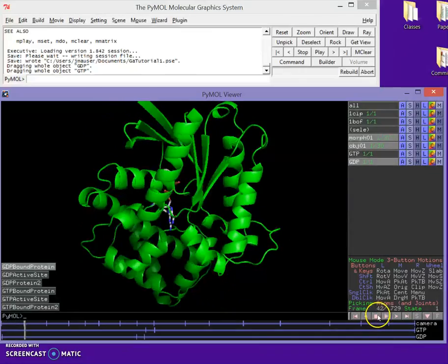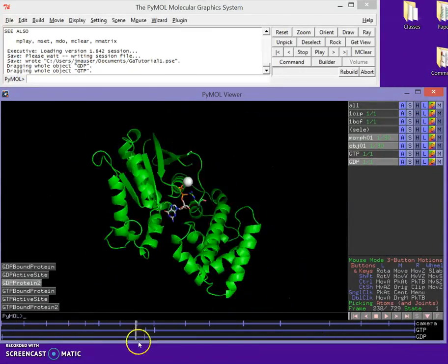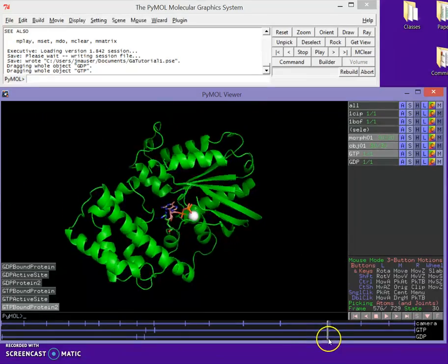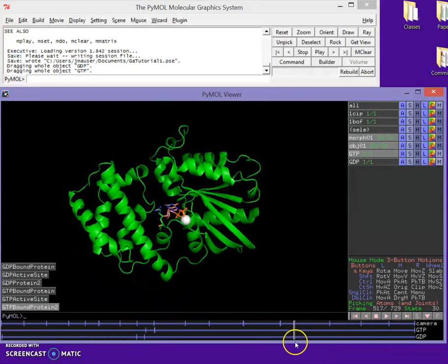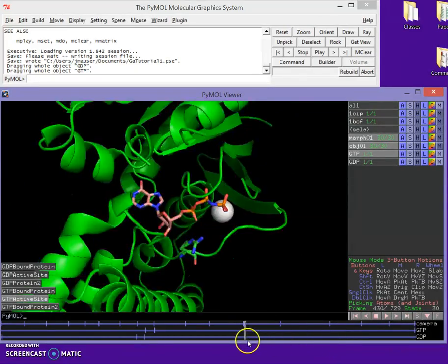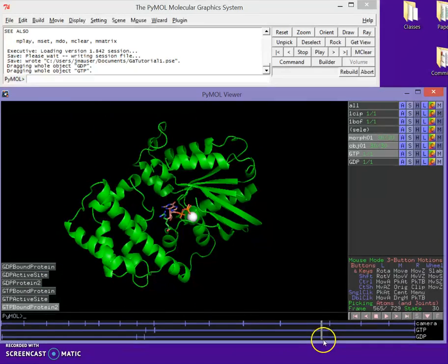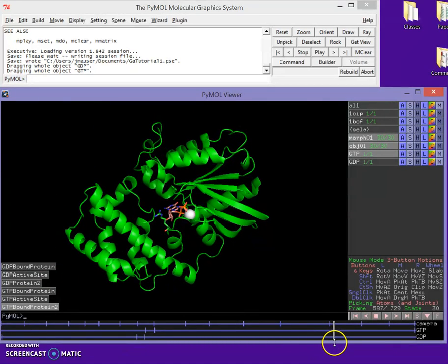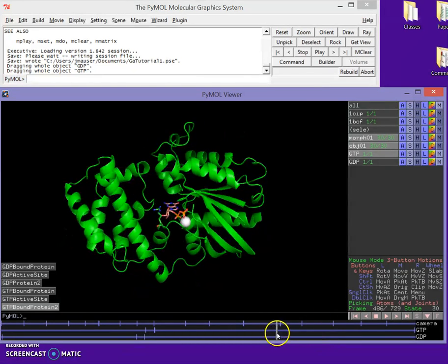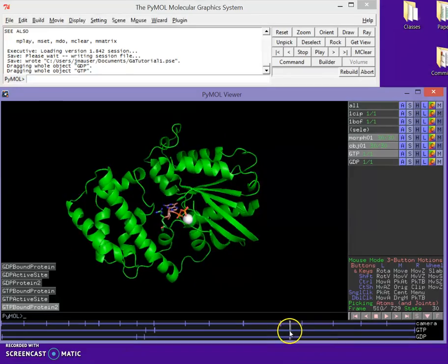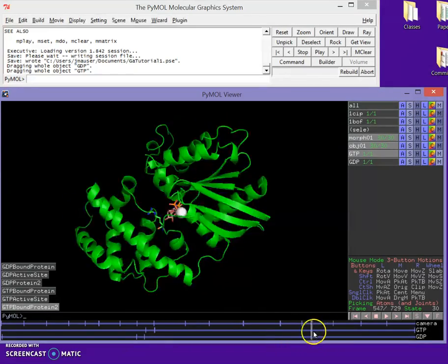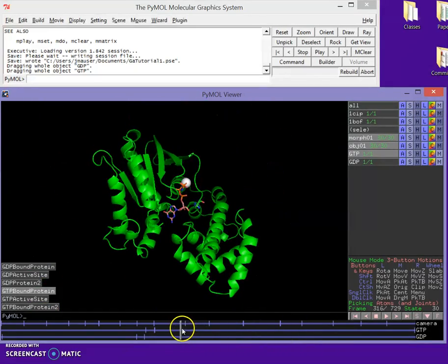So you can look at the whole protein and admire it. Now, I'm not sure I like everything about this movie. Let's just admire edits here. I've got a little bit of a long random gap here that's not doing anything. I have my hold, but it's kind of doing nothing. So I want to get rid of some of those frames. I'm just going to hold down Control, left-click and drag until it's red, and that'll just delete those frames for us. So we're going to zoom back out, and then it's going to do a good spin. Looks pretty good to me.